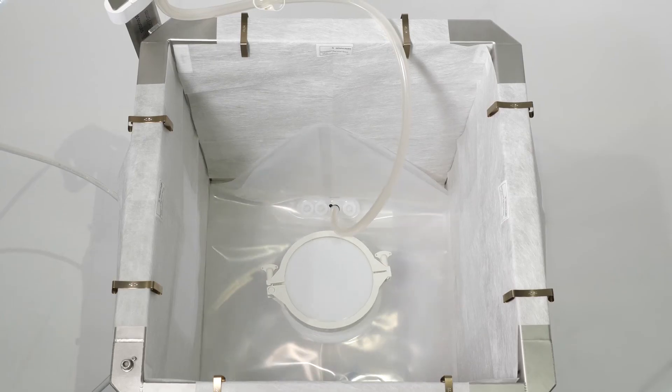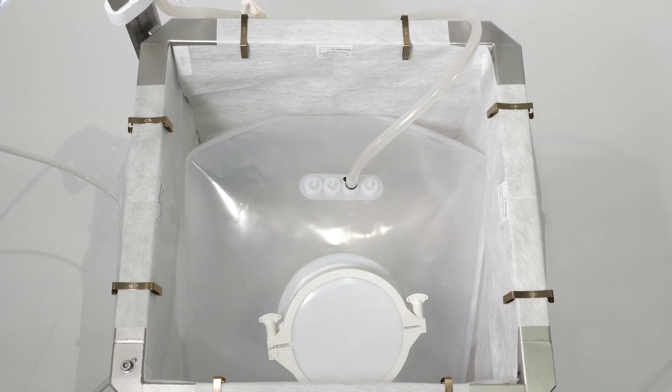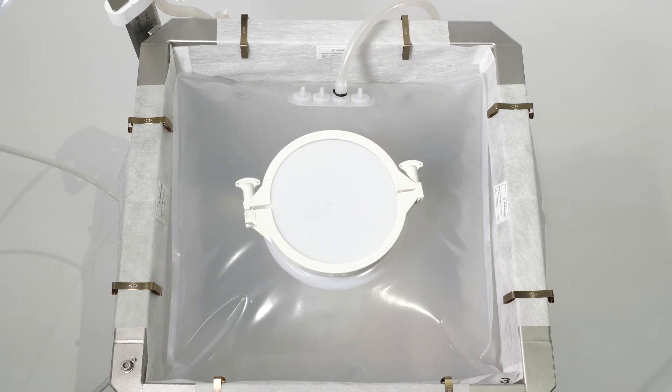Start filling the mixing bag with air. When the pressure is reached, after a few minutes depending on the bag volume, the airflow stops. Close the compressed air supply.